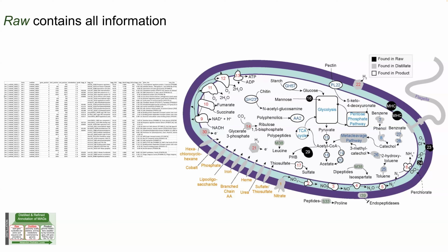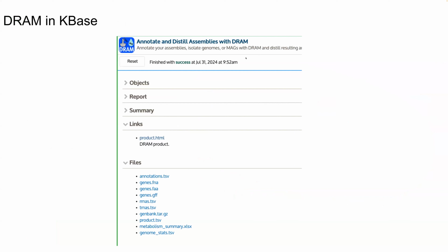Say if you run, especially if you run tens or hundreds of thousands of genomes through DRAM at once, you're going to see patterns follow on that heat map pretty well. So I would say, yes, you should be able to see that kind of cooperation. And also just to say, that product heat map is an HTML. It's not currently sortable. That is a feature that's coming out in DRAM 2. We're going to have a sortable heat map, so you could say, I want to sort by methanogens or whatever.